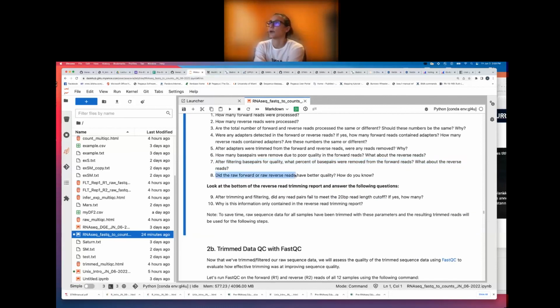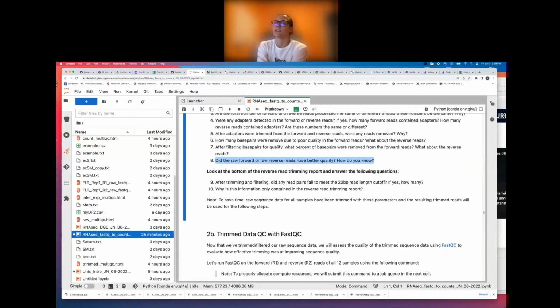Did the raw forward or raw reverse reads have better quality? That one I think we covered pretty good too. Sorry, I know I'm skipping around, we just have a minute left. So I'm just going to go over the answers to these questions. But after trimming and filtering, you guys put in the chat, did any read pairs fail to meet the 20 base pair length cutoff? If yes, how many?